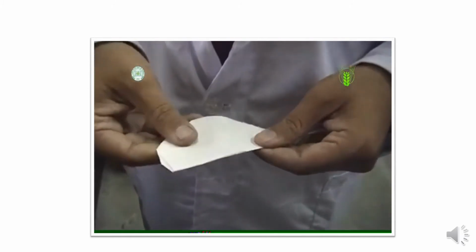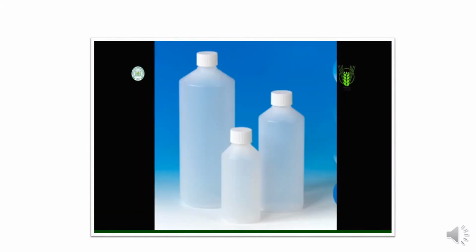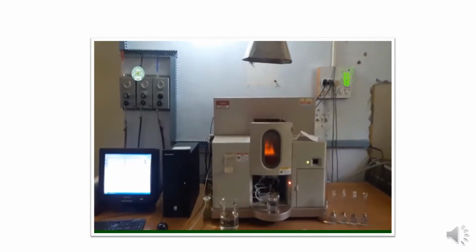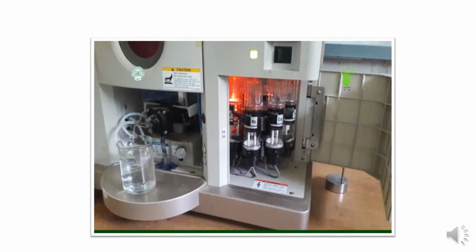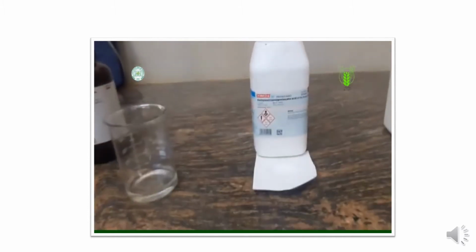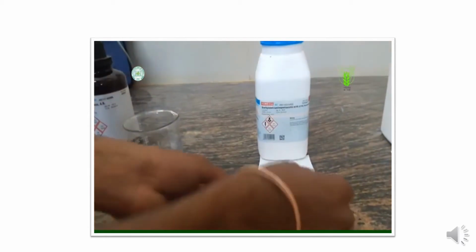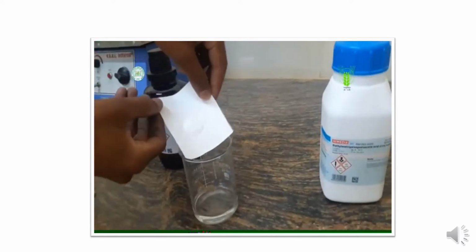We also need the electronic balance, as well as flasks of different capacities and volumes for the shaking purpose. We also need the pipette, and we will also be using the reciprocal mechanical shaker. And we also need the filter paper and funnels, and different bottles for distilled water.